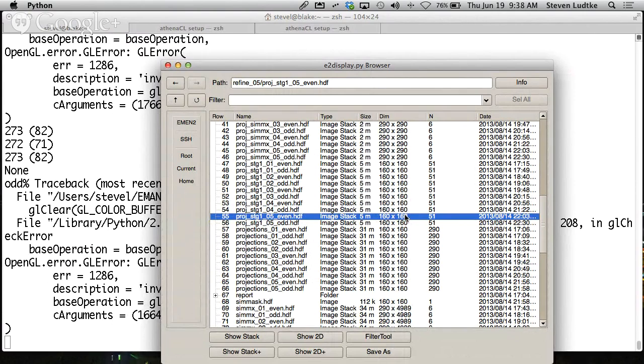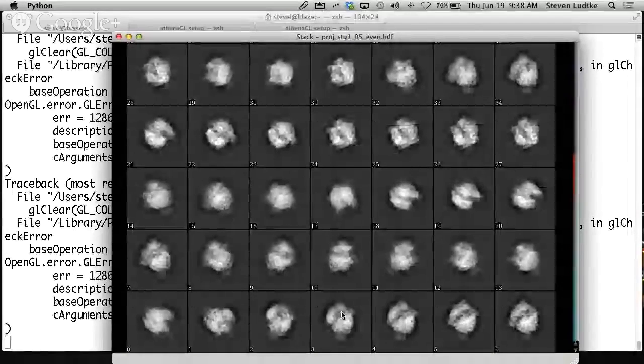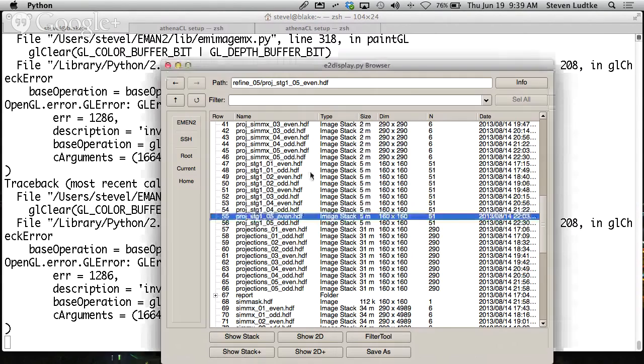We don't think you can trust the answer if we just classify each particle with the one orientation that it looks the most like. So we take each particle, find several orientations, I think it's 4 typically, which it looks the most like, and then take the fine projections associated with all of those different orientations. So we can't subdivide it quite as much as we'd like, otherwise we sometimes get the answer wrong. We're doing a little bit of oversampling in projection space, sampling a little more than we really would need to on paper, just to double check and make sure that we're really finding the right orientation.